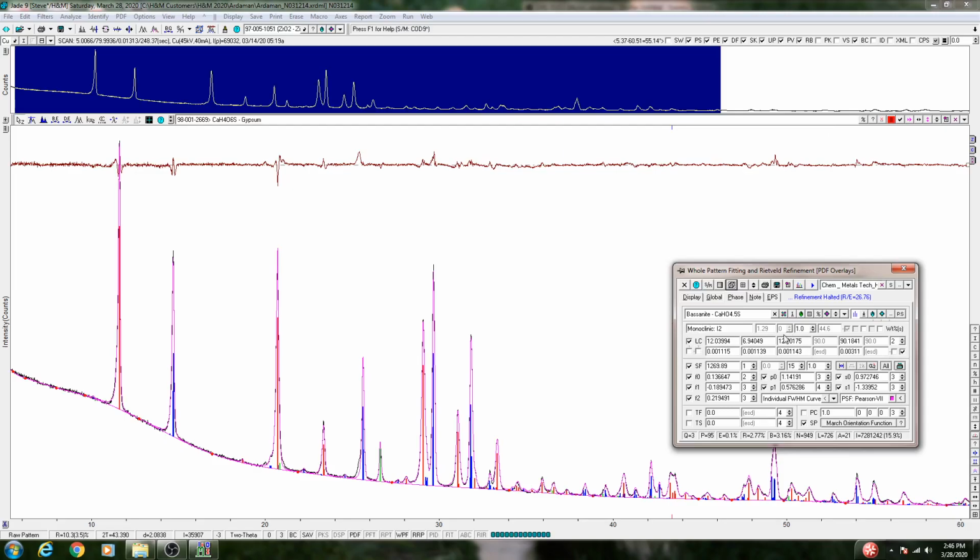So obviously if you're doing some kind of a doping study and you want to see if the doping affects your lattice parameters, you might take 3 different samples with 3 different doping levels, measure the lattice parameters using X-ray diffraction, do a Rietveld refinement on them, and then compare the lattice parameters across those different levels of doping. Anyway, we do have an output, so there is a report generator. Create new report.